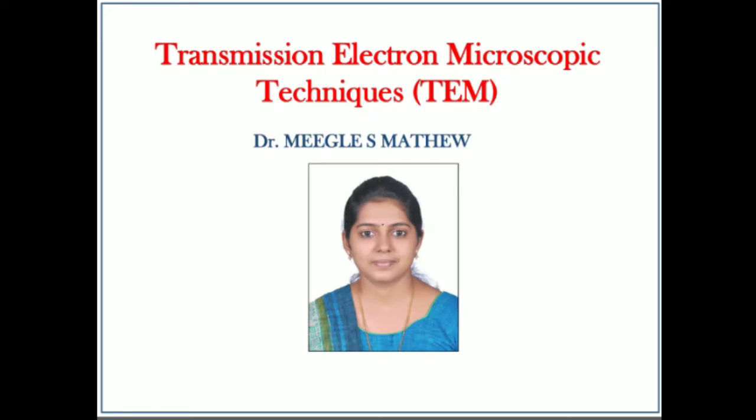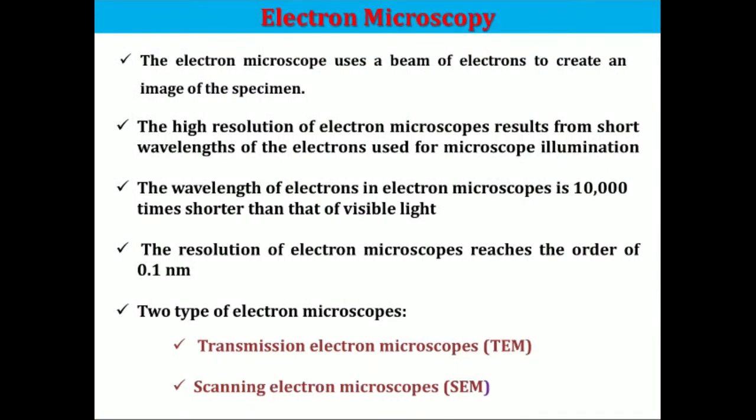In this lecture, I am going to discuss transmission electron microscopic technique. It is considered one of the important electron microscopic techniques used for the characterization of nanomaterials. The electron microscopic technique uses a beam of electrons to create the image of the microstructure of a material with much higher magnification and resolution than that of a light microscope.